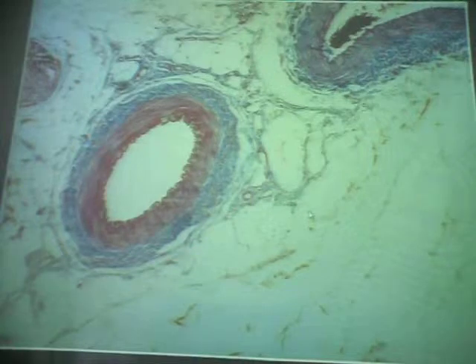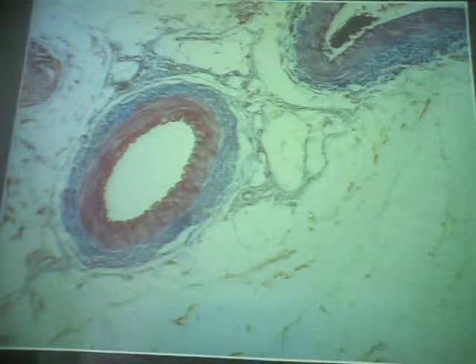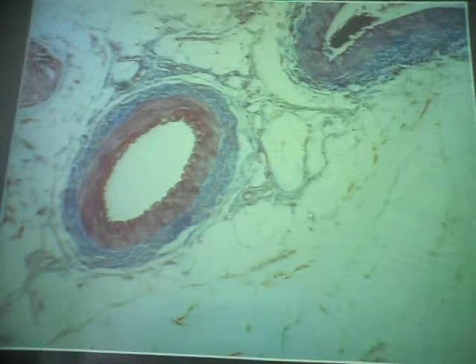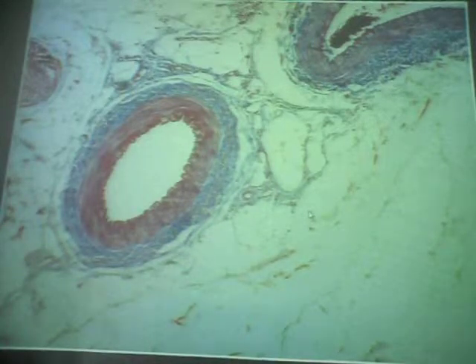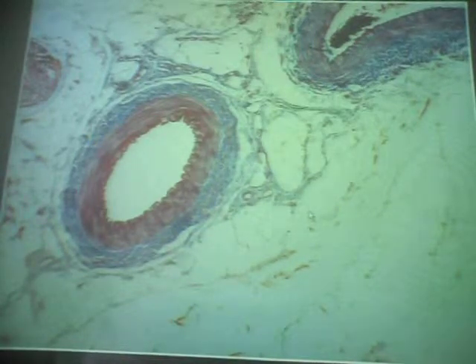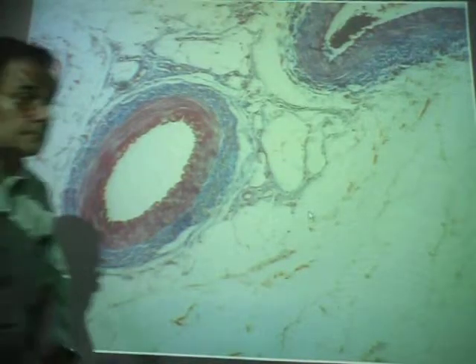As we're going to see, these ducts in the digestive system, salivary glands, liver, pancreas, and so on, usually the small ducts are simple cuboidal epithelium. What does cuboidal look like? Cubes. What's the nucleus look like? Round. They're almost the same, round, okay? And in columnar cells, it's an oval nucleus. So you look at the shape of the nucleus, it's normally well stained because you can't see the cell boundaries.